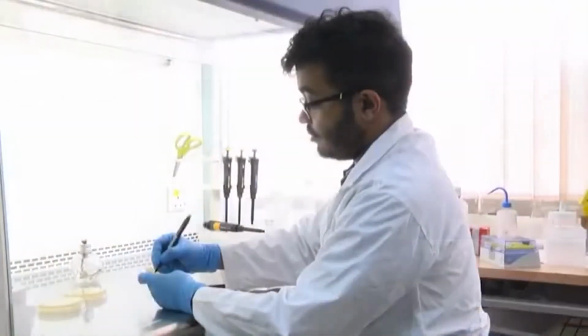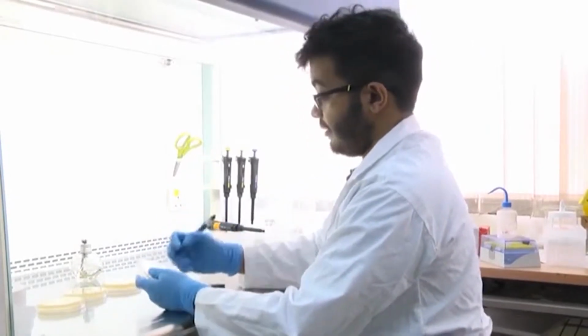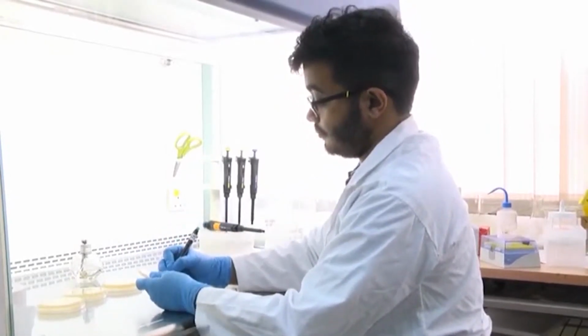Yes, let me just finish labeling the last plate, then we are going to move on.